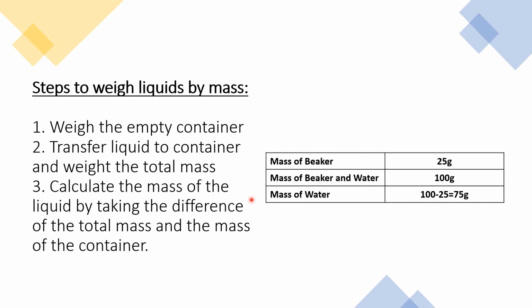And this technique is really effective, mostly because in an active lab where there aren't many balances, you can't really tare the balance and do a reaction and come back half an hour later expecting that the balance is going to be ready for you to weigh. So if you know what the mass of the container is at all times, you can always just do that conversion yourself. I will show you how to tare our balances in the video, but it's not a technique that I would recommend doing from the day to day, I guess.